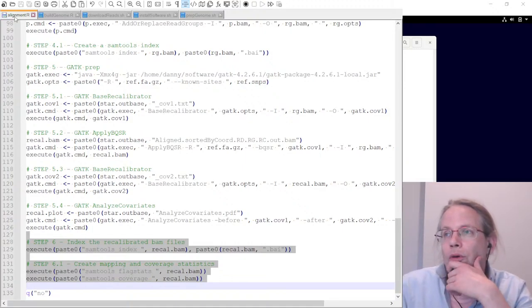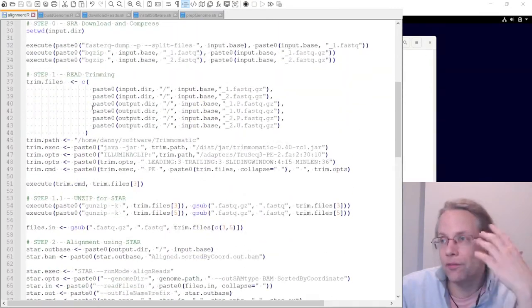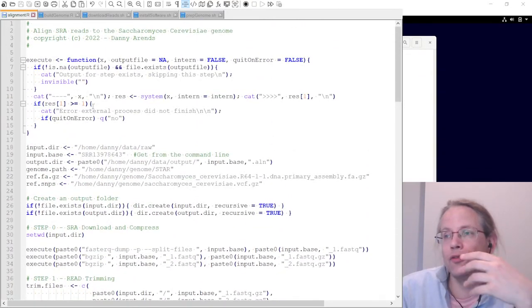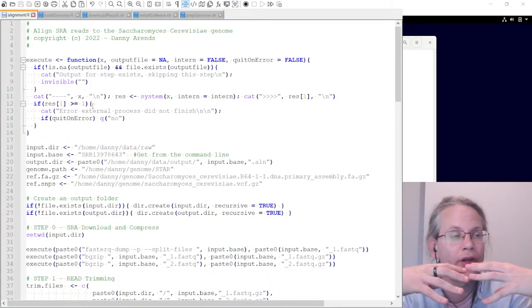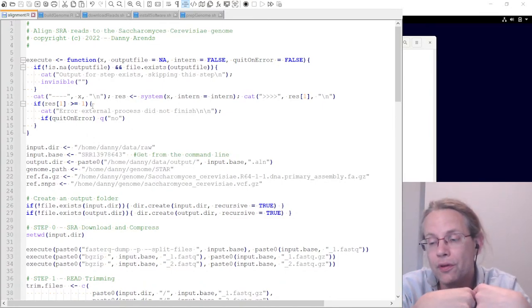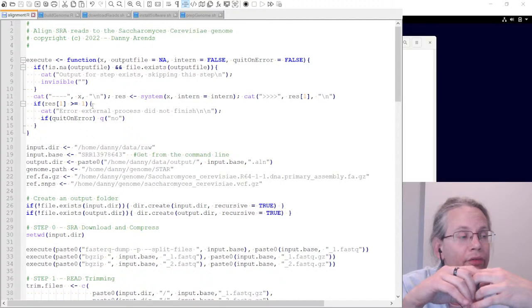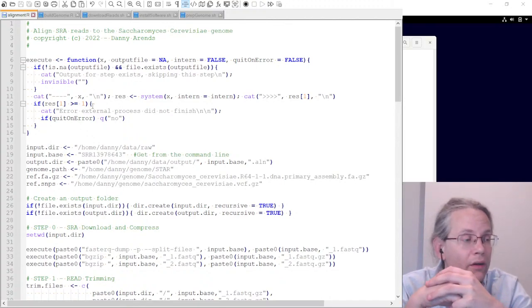Good. So I will probably update the alignment file. It's just one way of doing it, right? I'm just using R, using different tools that we installed to do the mapping and the expression. Like we saw, it's not going to be perfect, especially not on chromosome 12, but it is a start and we can work from here, right?